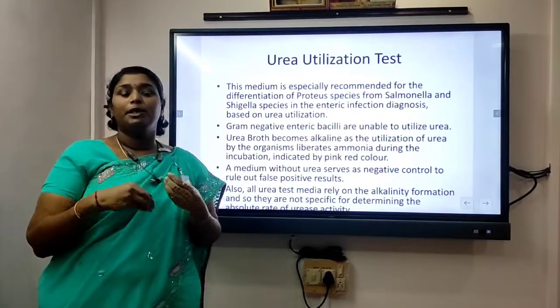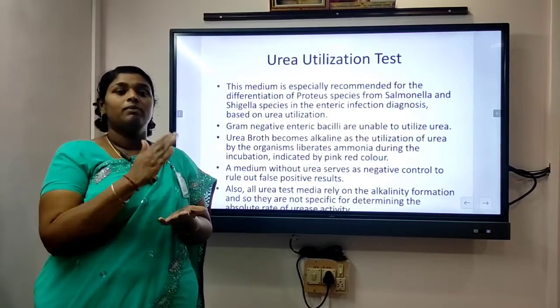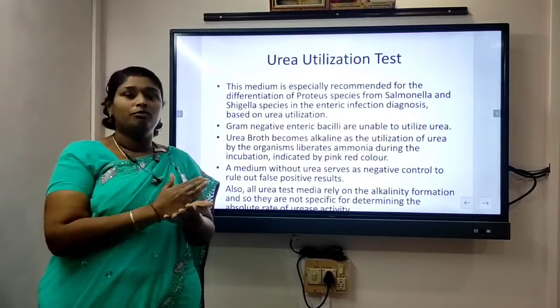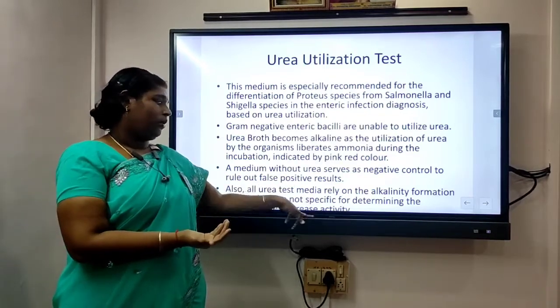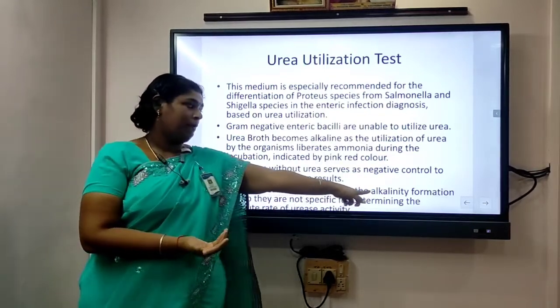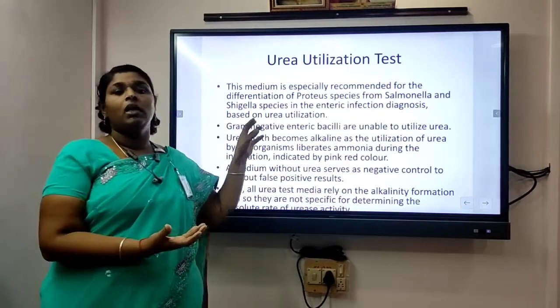So they have an ability to synthesize an enzyme called urease. That enzyme urease will be splitting up, converting the urea into the alkaline products. As a result, alkalinity will be formed in the medium, so they will be changing the pH.